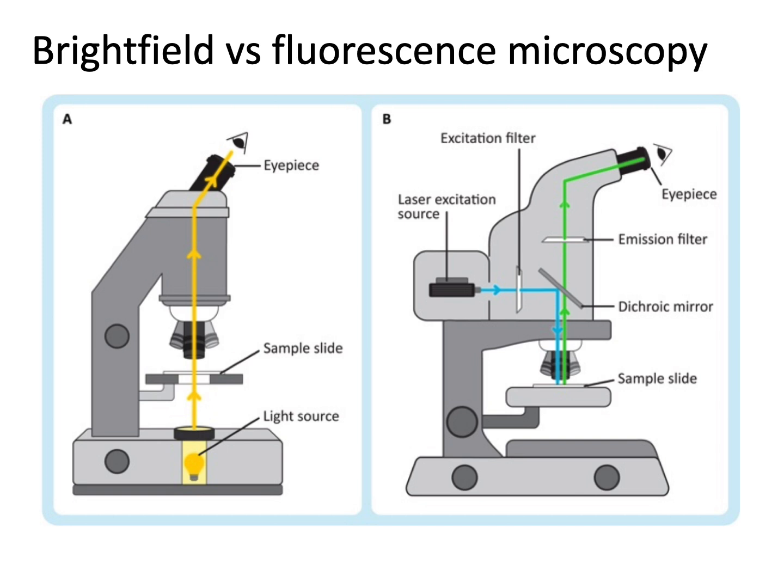A fluorescence microscope is shown on the right, and it behaves very similarly. The only difference is that, if you remember, something that's fluorescent needs to get excited by a certain wavelength, and then it emits light in a certain wavelength. And those wavelengths are different because energy is lost in that transfer.